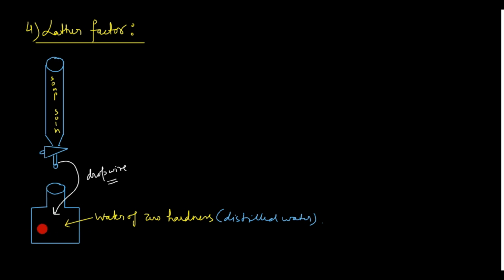any formation of the lather happening or not, right? And you continue this process in the same way as I have explained for the standardization of the soap solution. Whatever the volume of the soap solution consumed in the case of the lather factor, you will note this value as the V4 ml. Please remember, you will note this value as the V4 ml.